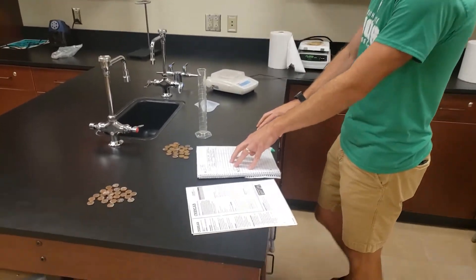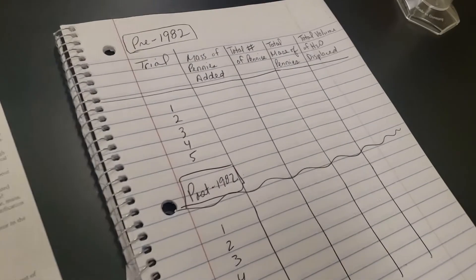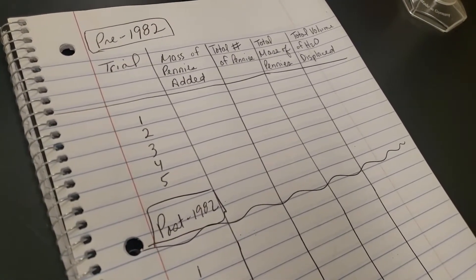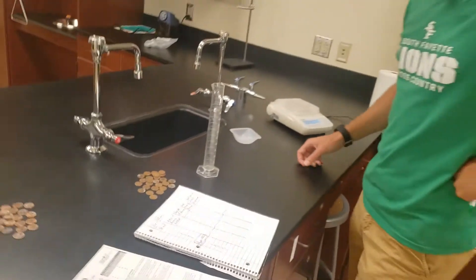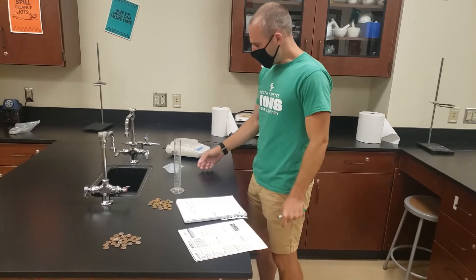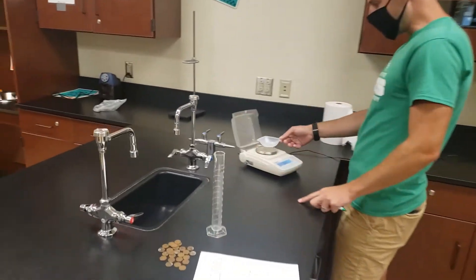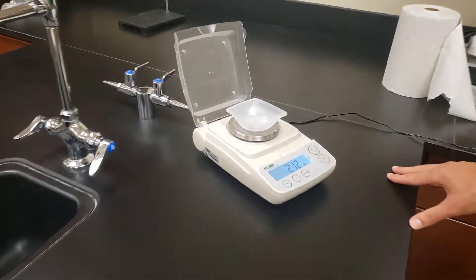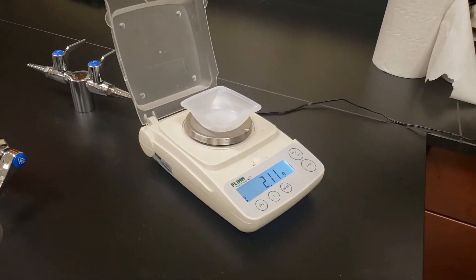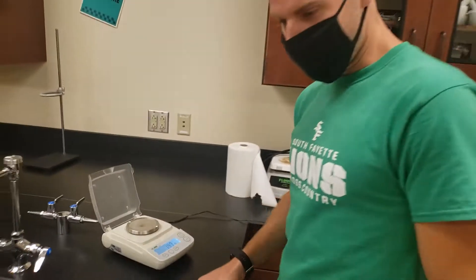Ahead of time, I've gone ahead and made a data table to record all of my information needed in this experiment. So picking up with the procedures, one of the first things I need to do is record all of my measurements. One of those is to measure the mass of our plastic weigh boats using my digital balance, recording that measurement to the appropriate precision as indicated on the instrument. I've got 2.11 grams for this.